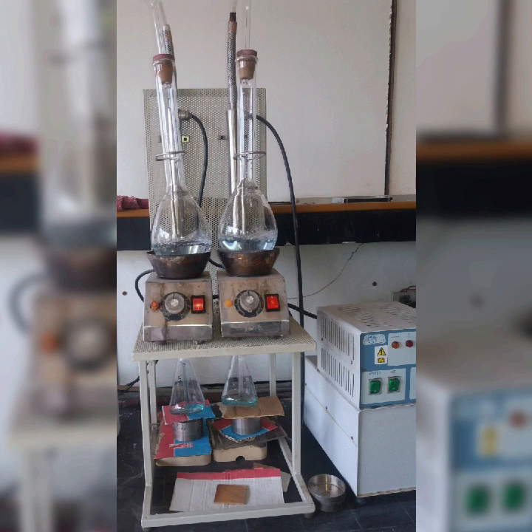And to make sure we don't miss the endpoint, we use a color indicator. Think of it like adding dye to see when your tea is strong enough. By the end of distillation, all the nitrogen from the original protein is now locked in a new solution, ready for final measurement. The final act, titration.